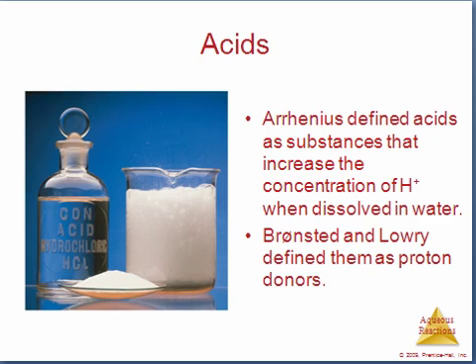We're going to look at another type of metathesis reaction, the reaction between acids and bases. So let's look in more detail at acids. And here we have a bottle of concentrated hydrochloric acid. This right here is some sodium carbonate, and when we add the two together, we get a bubbly reaction.